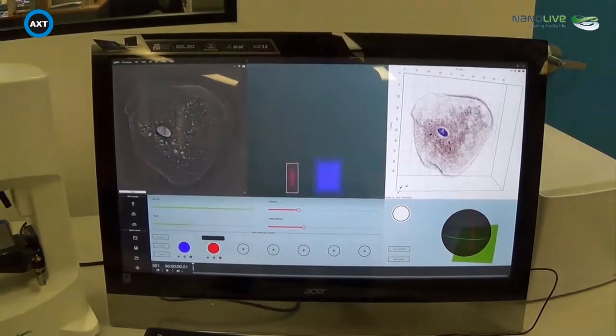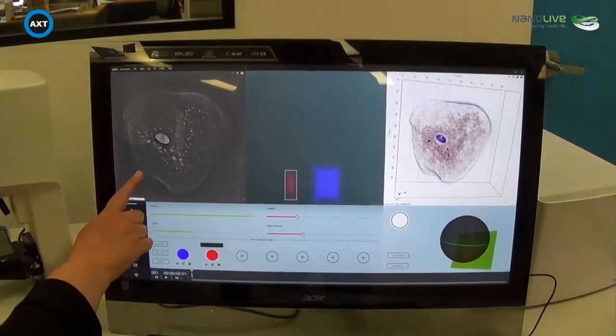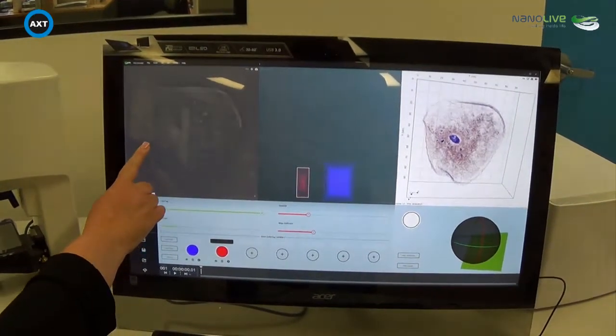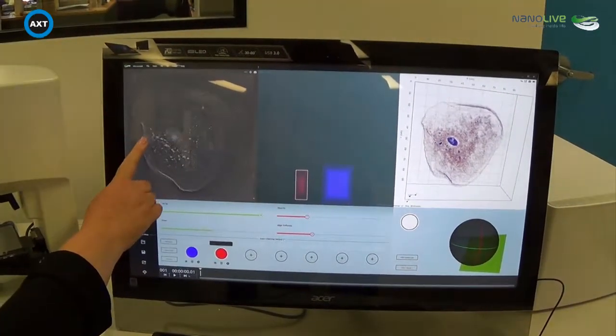On our touch screen, we can also go through the slices simply by moving through up and down on the screen to go through the slices as well.